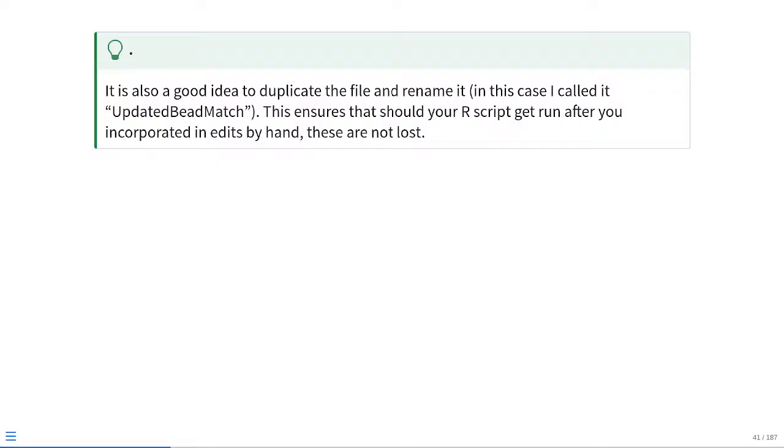So if you're doing this as part of your regular workflow and you do output this as a CSV file, one word of caution I would recommend is that every time you run a Quarto Markdown document or an R script, it has the potential to overwrite anything that you end up correcting by hand. So if you do output one of these CSV files and put in the effort to update those detector columns with the corresponding matching detector, save that intermediate CSV file with a new name, and then load that new name CSV file into R. That way, even if you accidentally hit run all chunks above, the CSV file won't be overwritten, and you'll still have the properly formatted file to be able to use.